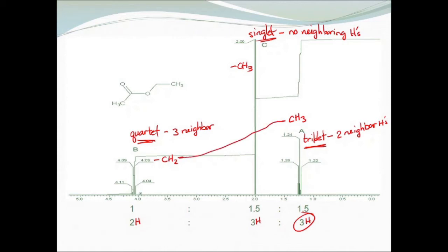So at this point we can start looking at chemical shift. This is around 4.0, but the range between 3 to 4.5 in our table means that this is bonded to an electronegative atom such as oxygen. This is the alkoxy region. At 2.0, this is the region where we find CH that's bonded to a carbon that is part of a double bond. So we have something of this sort. At about 1.2 ppm, this is alkyl, meaning this is bonded to another CH group of some sort. And so all of this makes sense then.